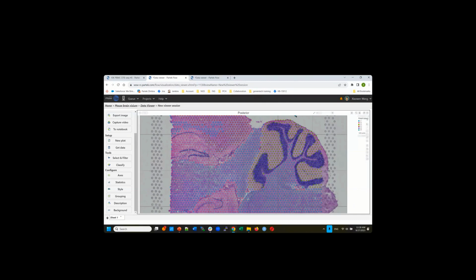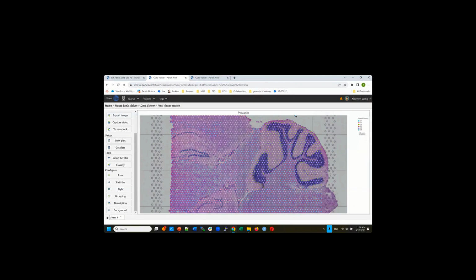I already sent the information to your IT, and they should update it pretty soon, if not updated yet. So with this paint mode, you can just select. As you go along, you select all the cells, right? Whatever you want to select, you can make the brush bigger to select more as you go along, or you can make it smaller.